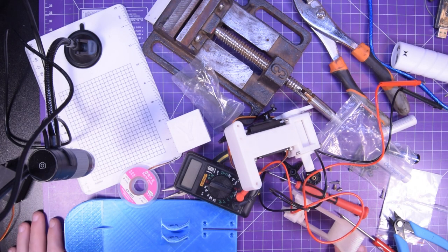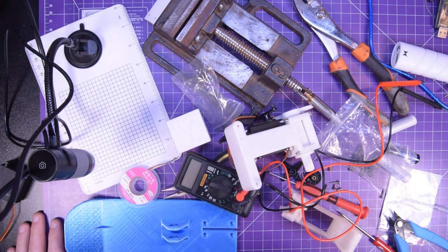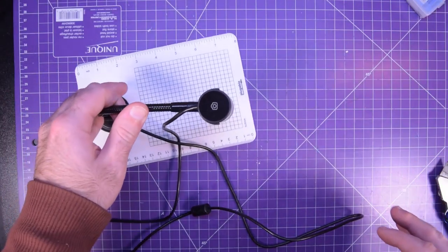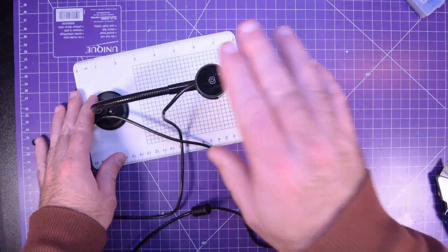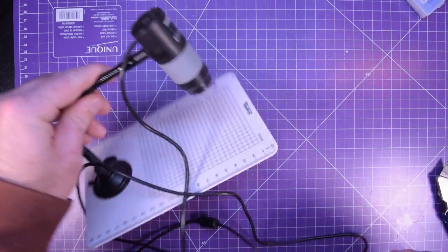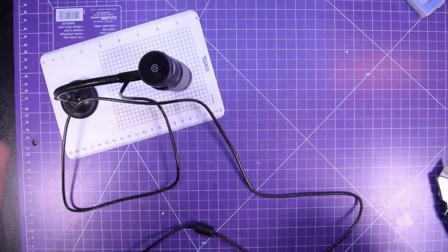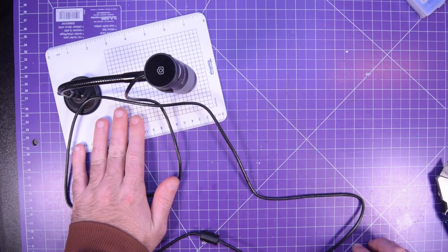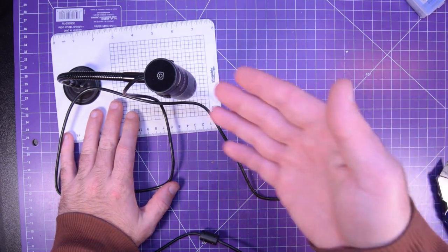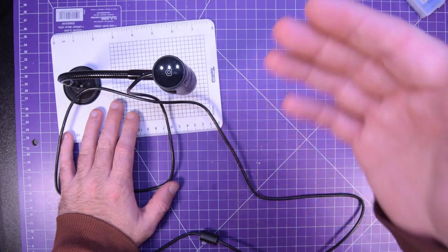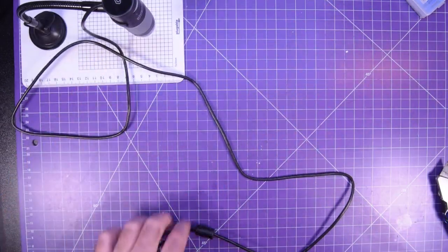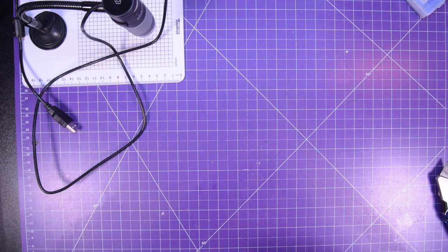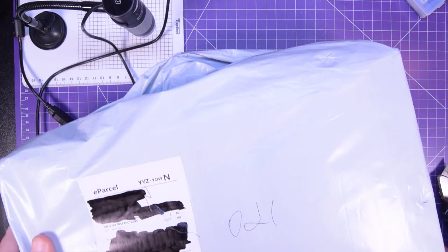Well, this place is a mess. Maybe I should clean this up first. Most of you know that Plugable had sent me this little USB microscope thing, which I really like. It works pretty good, it just does the job, and it's not very expensive. But as you saw very likely from the title and the thumbnail, Banggood has sent me something else.